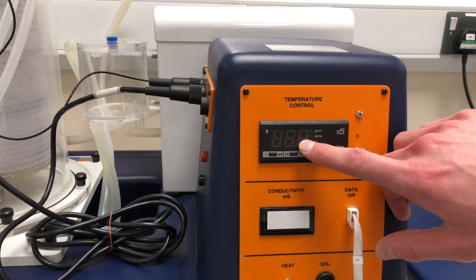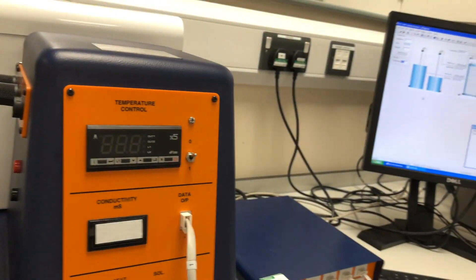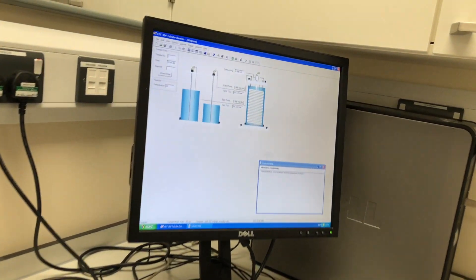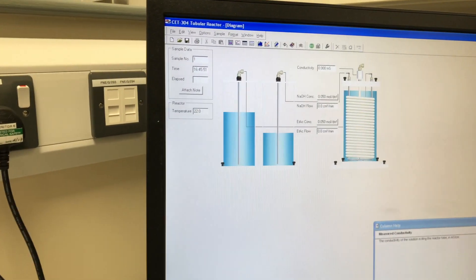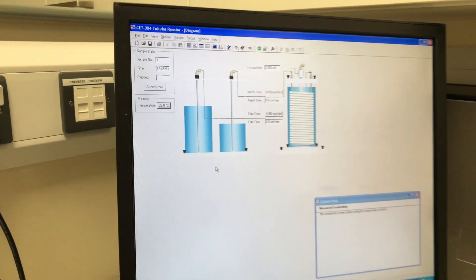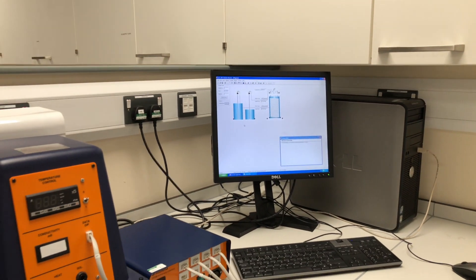So at the moment it says 25 degrees, which may not be the exact temperature. So you have to read on that control unit just here. And this temperature displayed here, you will need to manually input here. So for instance, if it's 22 degrees, 22.0, and then hit enter, and that's it logged. And it will continuously log until you end the reaction.